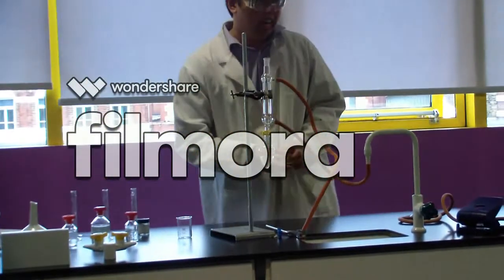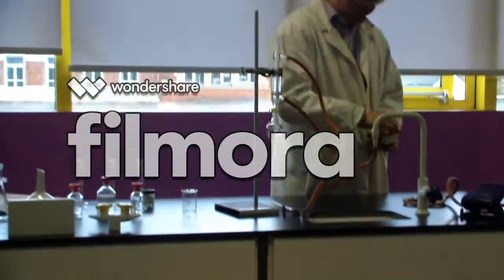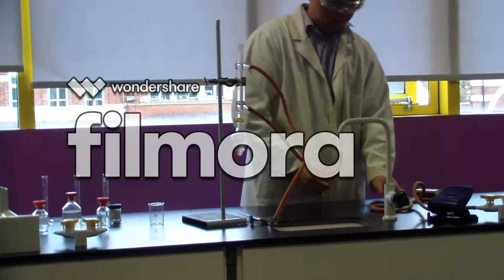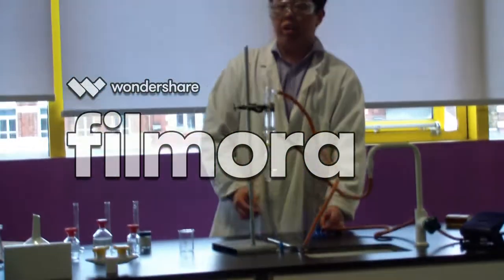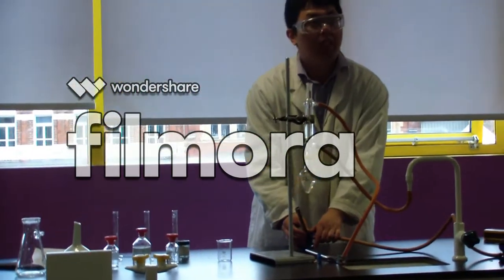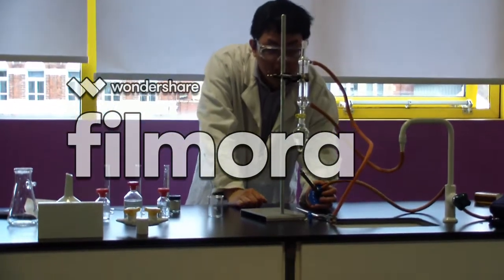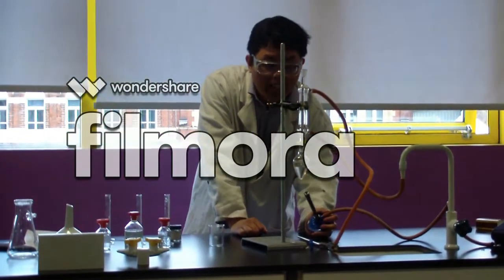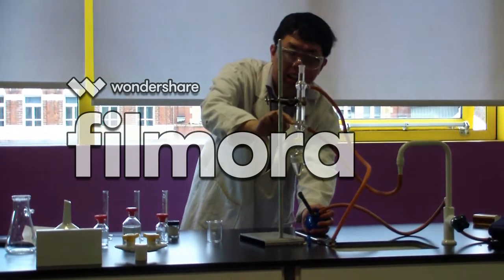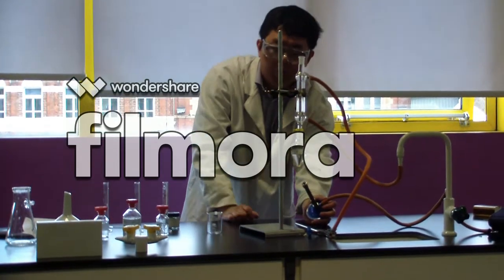Okay, I'm going to turn on the gas with the Bunsen burner. And then we just need to boil it for 15 minutes. Now, ethanol boils around 80 degrees, so it doesn't need to be violent. You just need to come near to the bottom of the condenser, and then you need to pull back down.